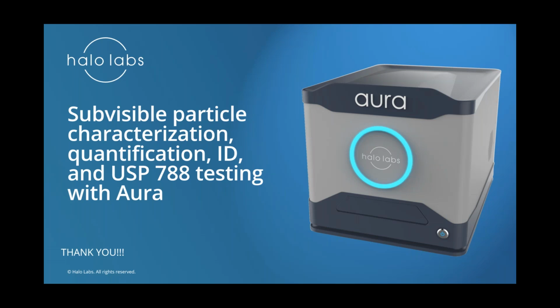The next question, to follow along the USP line of questioning, is what membrane pore size is acceptable for USP testing? The membrane pore sizes set forth in the chapter are basically just below 1 micrometer. Our default membrane size is 400 nanometers, which is well within that range.